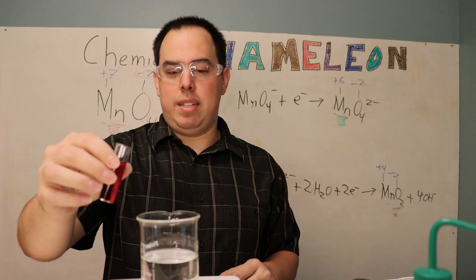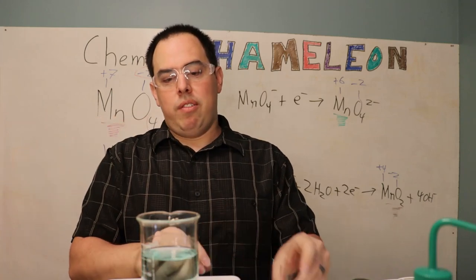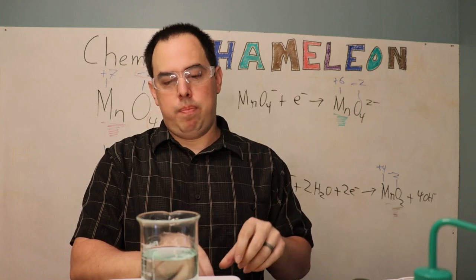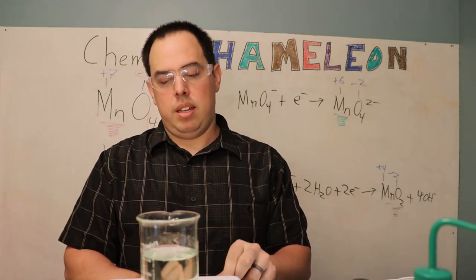So we have our potassium permanganate, we're going to add it to our sucrose water. So it went to that blue very very fast, now it's to the green and now we're going to pick up the stirring just a little bit and we're going to see it transition into a yellow.